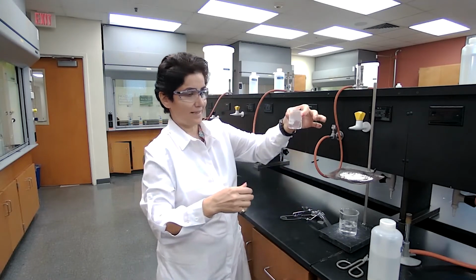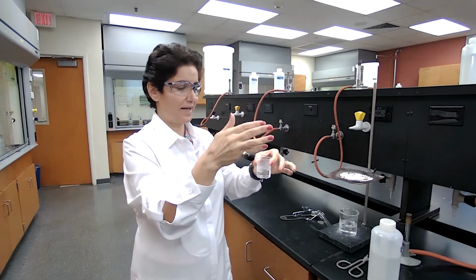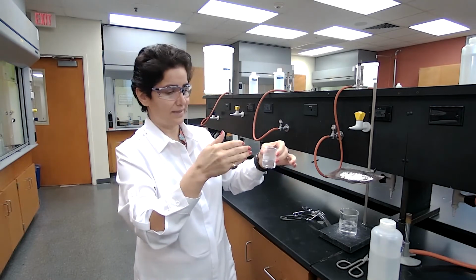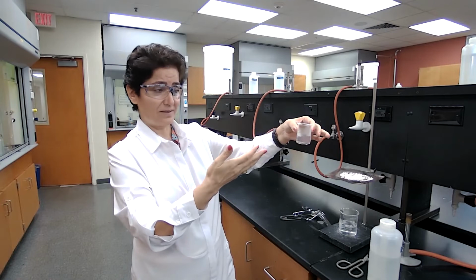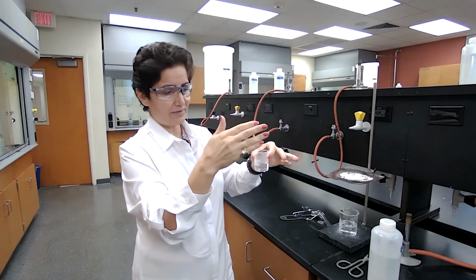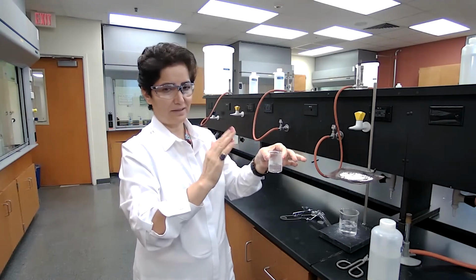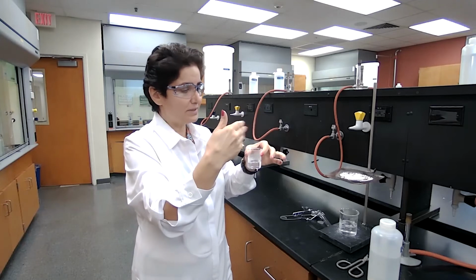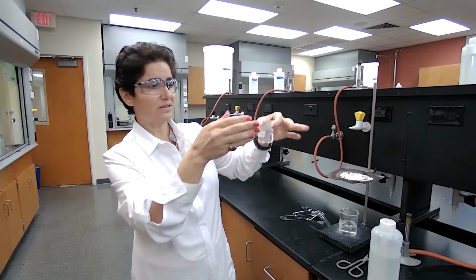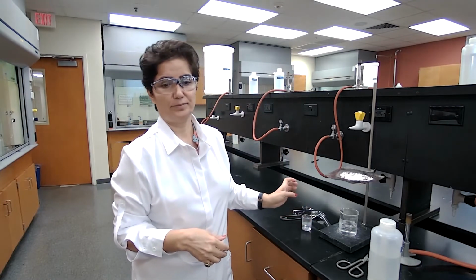Okay, this reaction has taken place, and I'm glad that we did this experiment because I had enough of the bromine odor and the pentene odor, which were not pleasant. At least we have an ester with a pleasant odor. The camera does not translate this. I wish you were here, but if you believe me, it smells just like spearmint or oil of wintergreen. And this is the ester that was formed. Thank you.